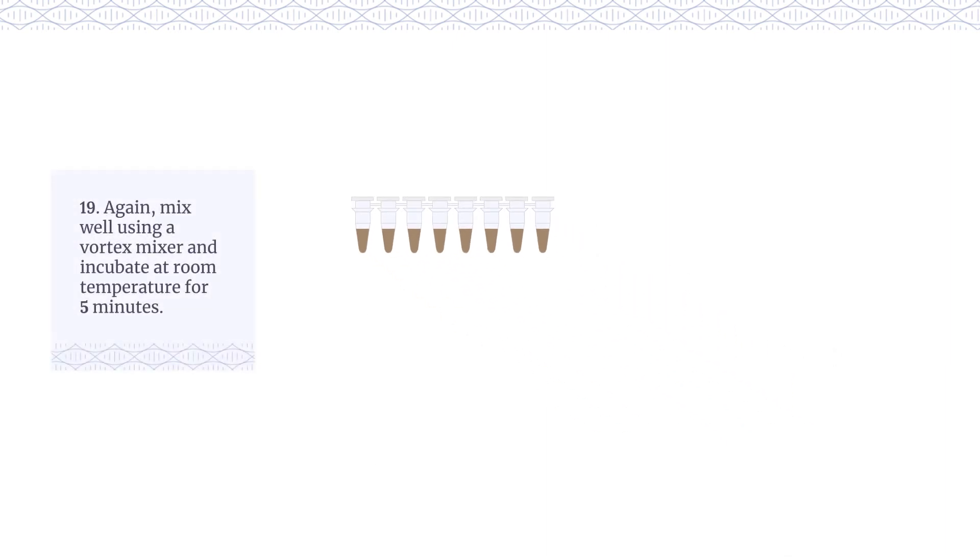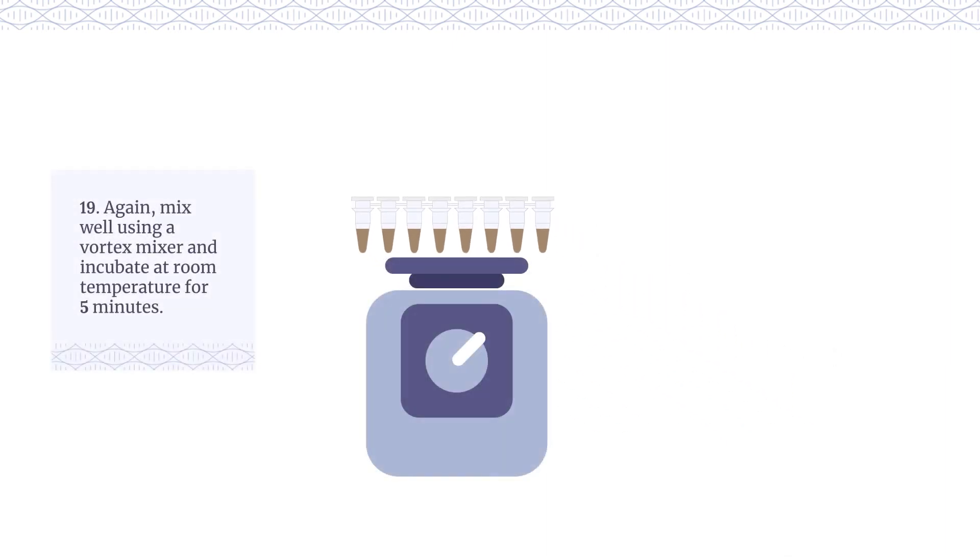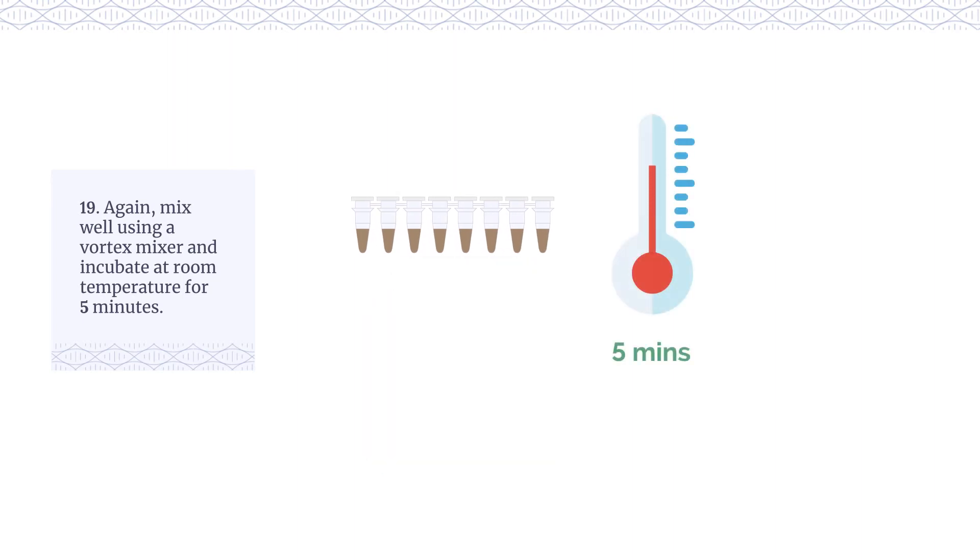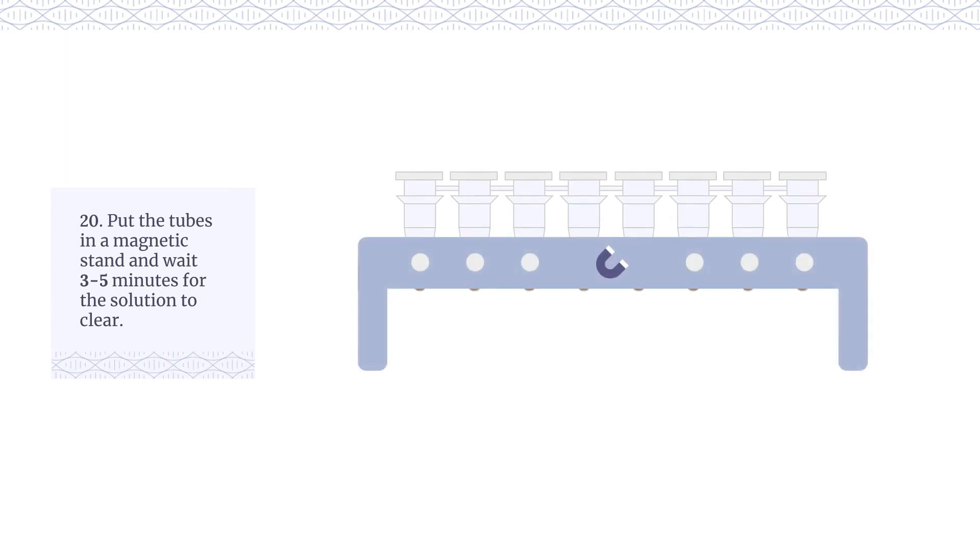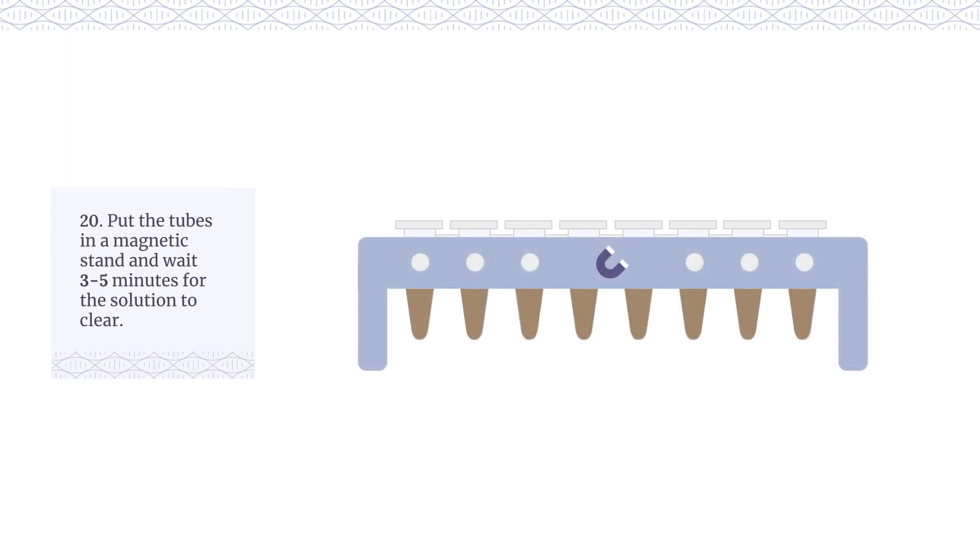Mix well using a vortex mixer and incubate at room temperature for 5 minutes. Put the tubes in a magnetic stand and wait 3-5 minutes for the solution to clear.